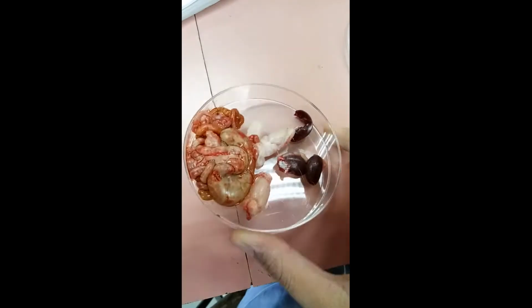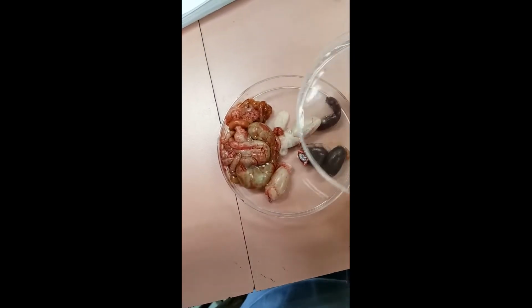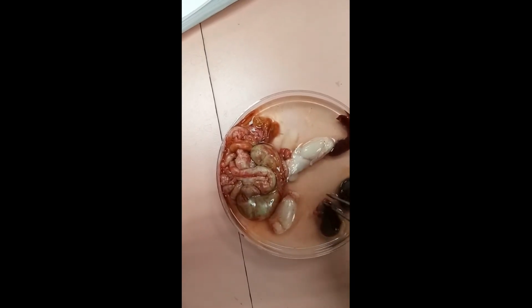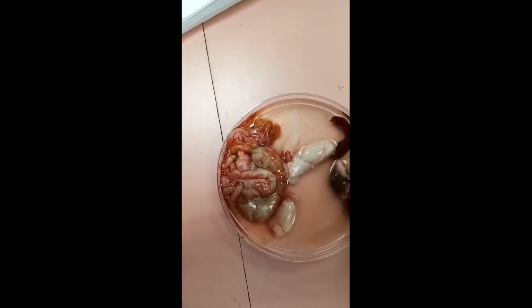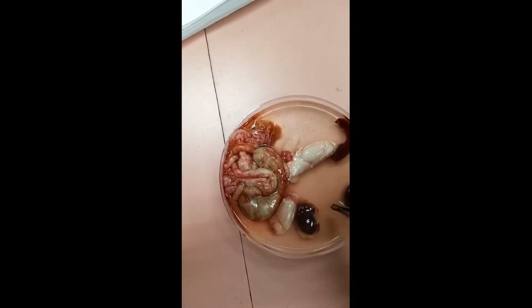Then we are going to rinse these organs with NaCl solution. So this is the NaCl solution. Put it in here, like this, to remove the excess blood before it is put into the formalin.